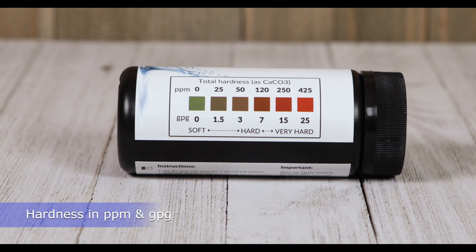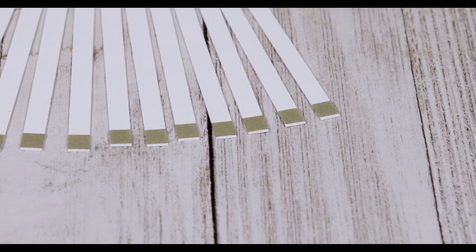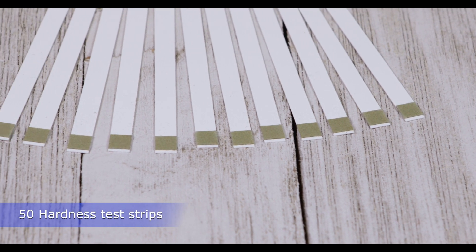The test strips provide water hardness levels in parts per million and grains per gallon. The kit includes 50 water hardness test strips.